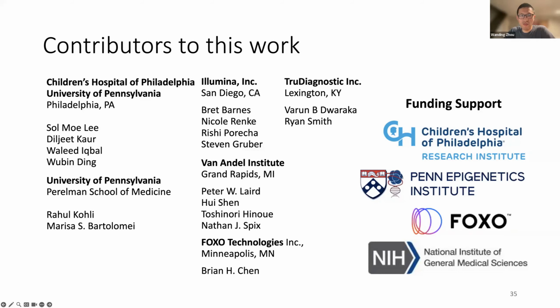But there is growing appreciation of, for example, 5-hydroxymethylation, and how we can use similar technologies but different conversion principles to query it, even to base resolution, and to study it on the same molecule with the 5mC. And by being more transient, you're probably talking about 5-carboxyl and 5-formylcytosine.